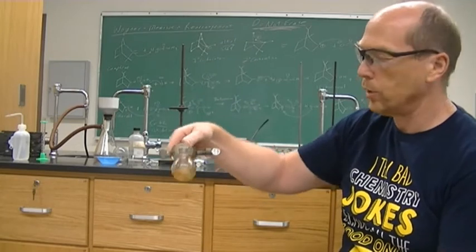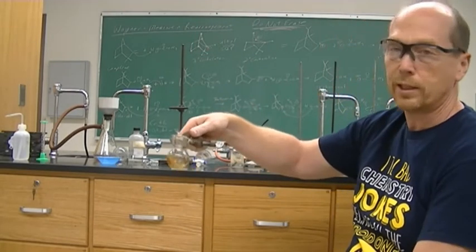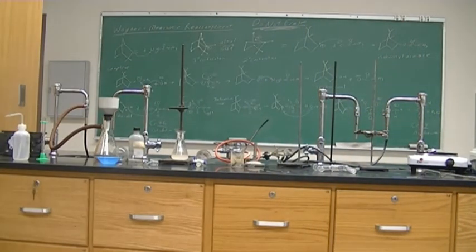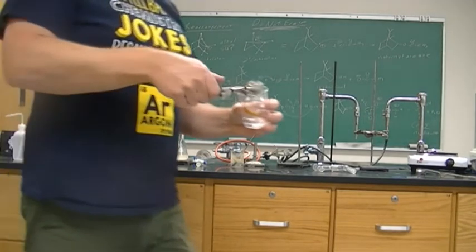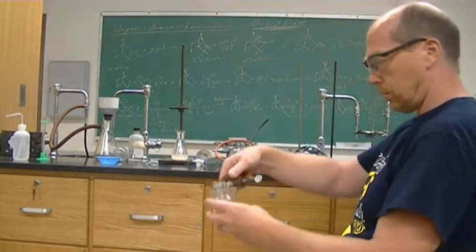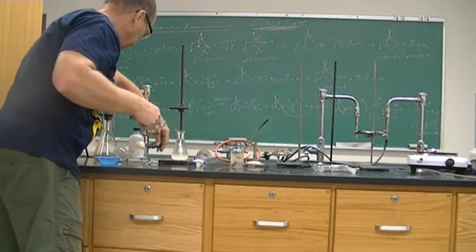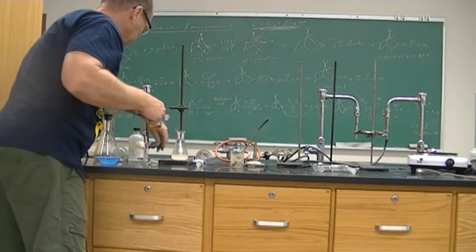Okay. Then we're going to cool this down. When you do an oxidation, it is exothermic. And again, if you do things at very high temperatures, you tend to get a lot of side products. So we're going to cool this down. It's not cooling much, it's just a little bit. It says between 15 and 25, so we don't need a whole lot of cooling.